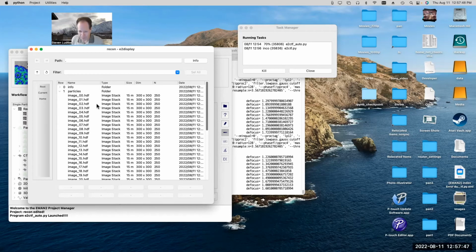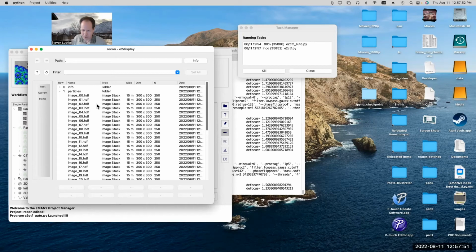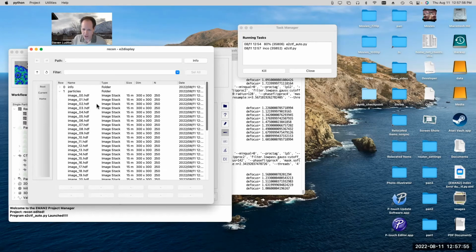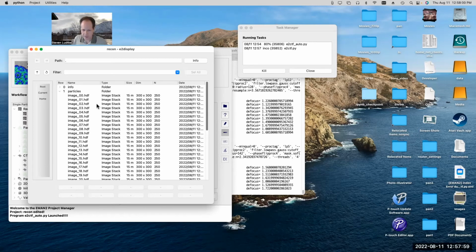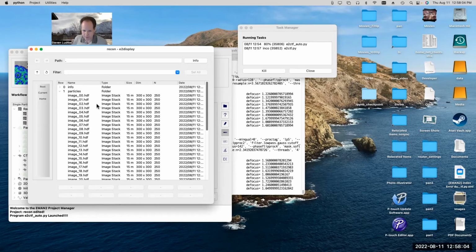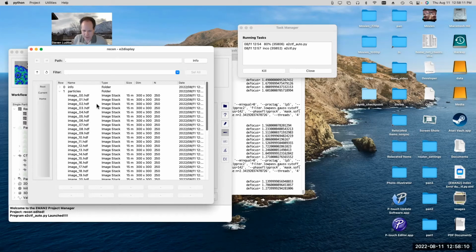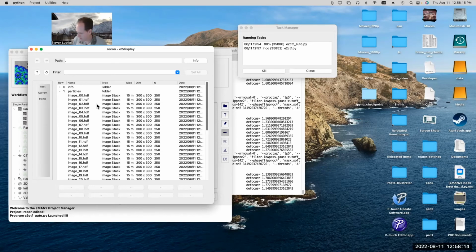I would say it's not really an issue nowadays. Pretty much all of the tools that do this do a pretty good job at it. It's always a good idea to manually look at at least a few of the resulting CTF curves and make sure that they look sane, regardless of the tool that you're using. But it's not really a limiting factor for anyone. It hasn't been a limiting factor for anyone for a decade.